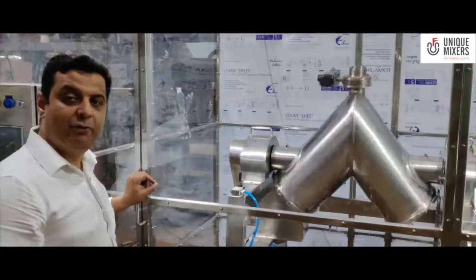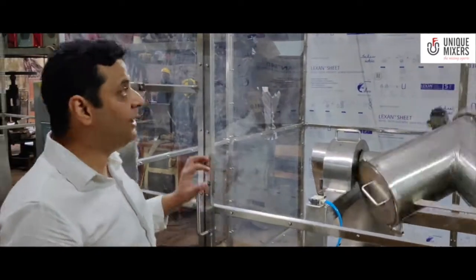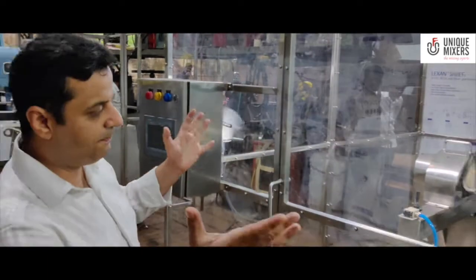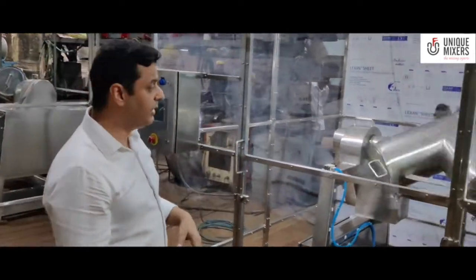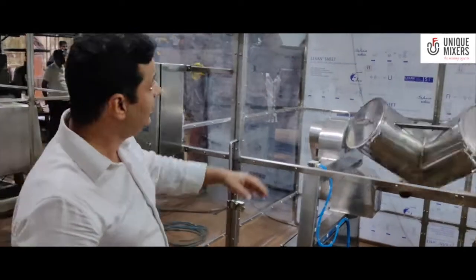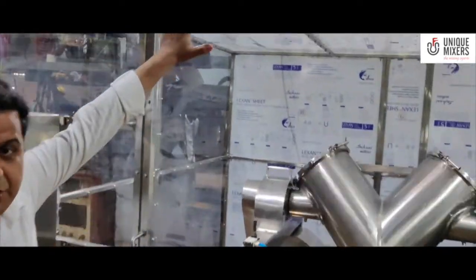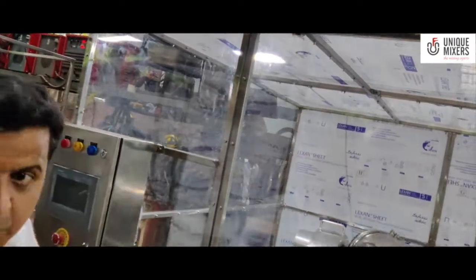This is the unique 75 liter V-blender and what we have here is a safety enclosure. The purpose of this safety enclosure is because it's a rotating component, it could pose a safety hazard. We have a switch here, a safety switch which ensures that the moment this enclosure is opened and somebody has to enter inside for operation, the machine will stop.